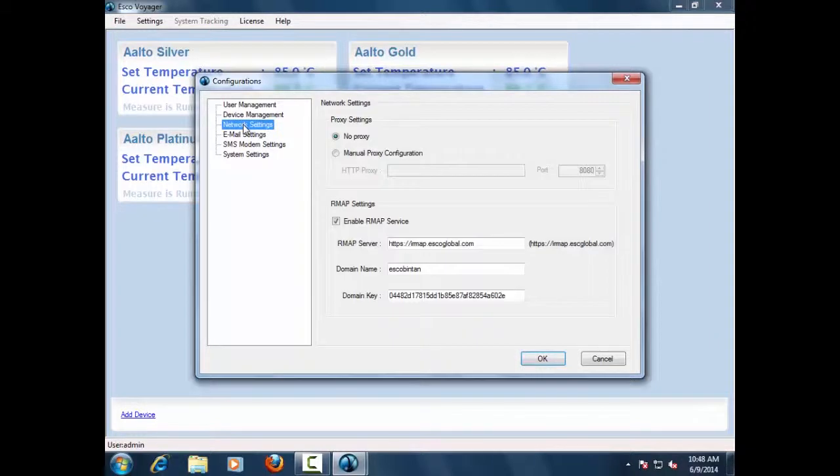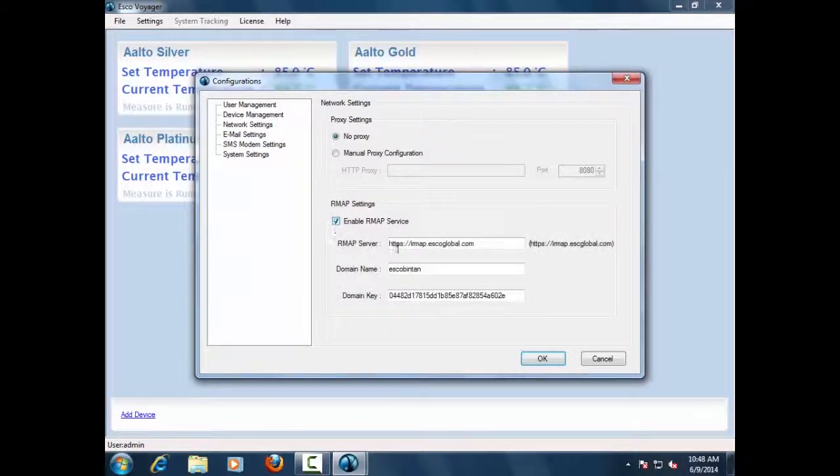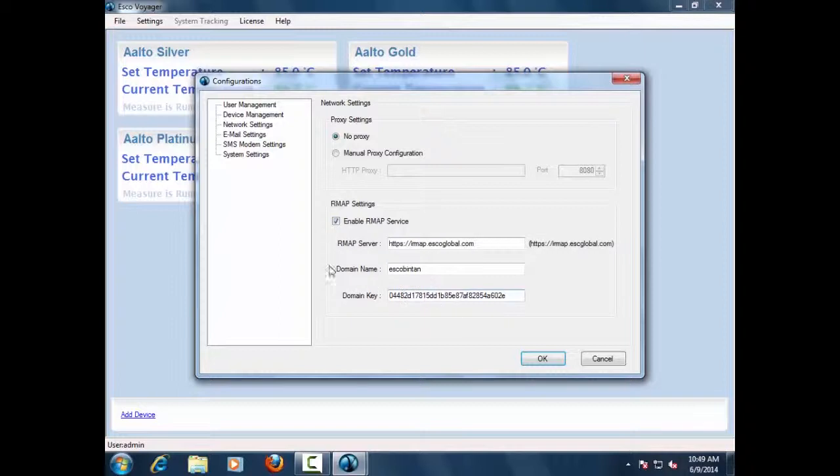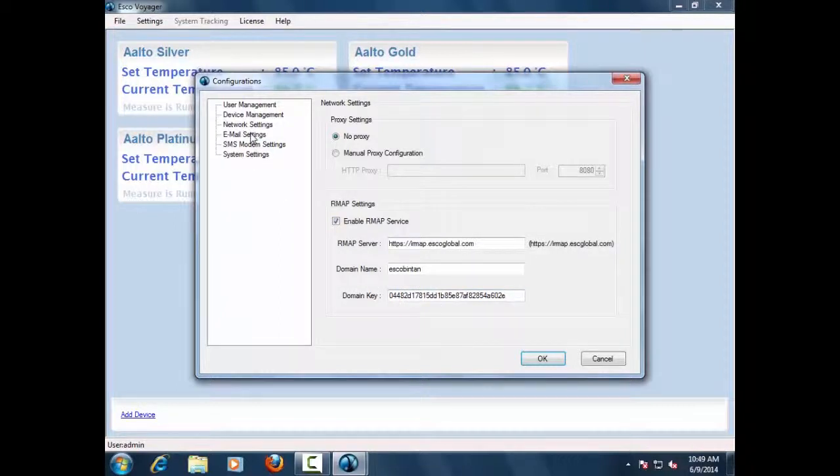Network Settings. The network settings tab consists of settings that allow entering proxy settings if any are maintained by the company server. Enabling of remote monitoring functionality via RMAP can also be controlled from this page.